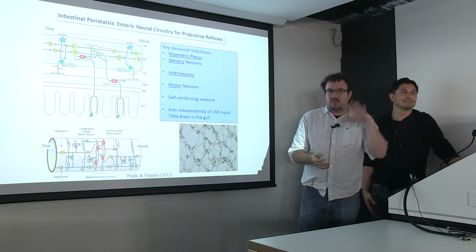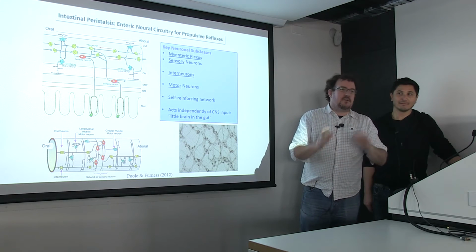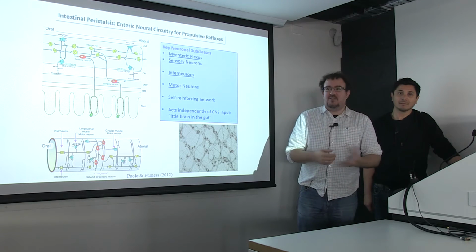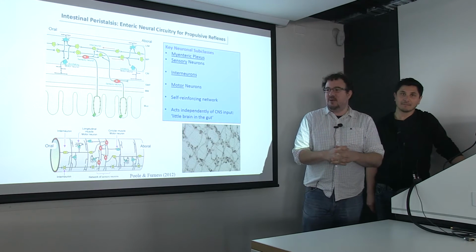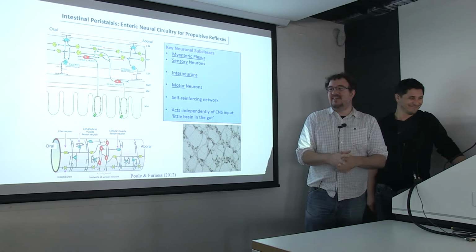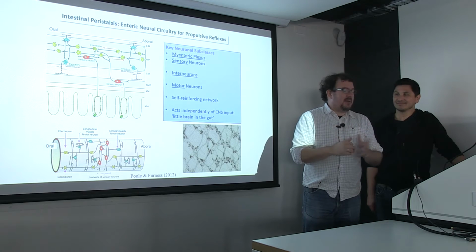I look after all the imaging equipment at MIPS. We have all the microscopes and flow cytometry and data analysis we do there. Most of the time I can write up code and get analysis done, but with Dan's question, we end up with something much more complex that we hope someone here can help with. Even just telling us the words to search for would be a great start, because we don't even know what we're really looking for. But basically, I think it's network mapping and everything else.